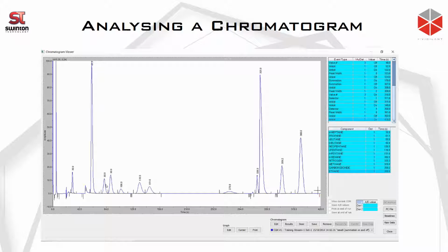If we go further here, we can actually see we got a few events there, and after these few events, we got basically inhibit on and inhibit off to detect all the peaks there. So as we can see here, before the nitrogen, we see the inhibit on over here. We got all the events that need to happen between inhibit on and inhibit off, and we got inhibit off over here, which basically happened just before the nitrogen peak to detect the nitrogen peak.